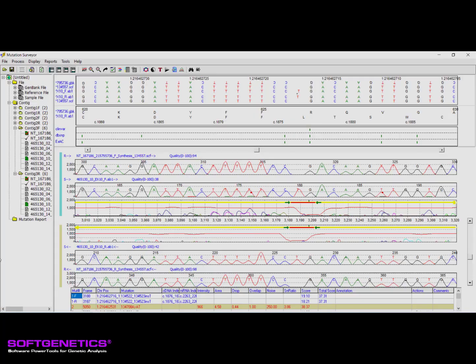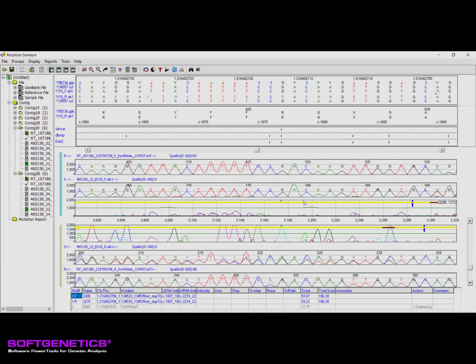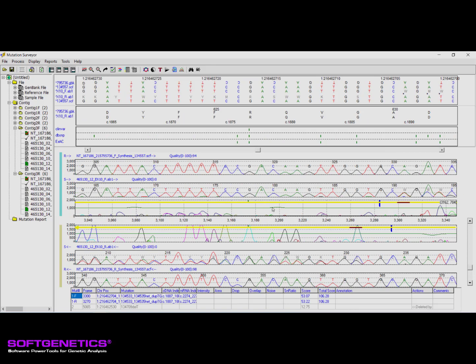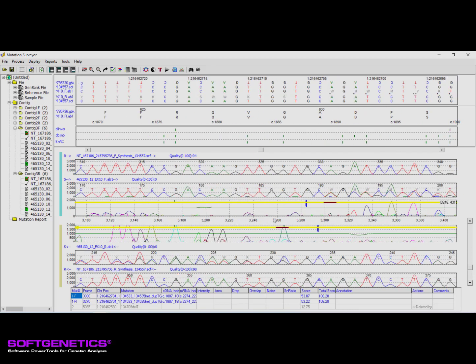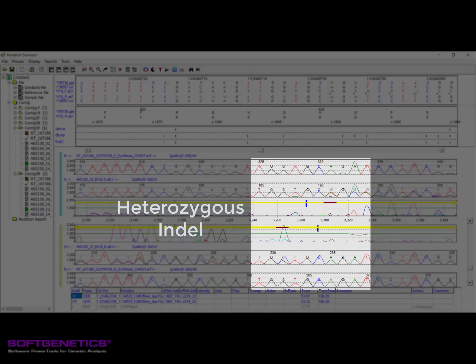Heterozygous insertion and deletion events are detected using the deconvolution of alleles and are indicated in the mutation trace by a horizontal brown bar across the start site. This variant type may be further analyzed in the heterozygous indel detection tool, which is covered in our heterozygous indel detection webinar.